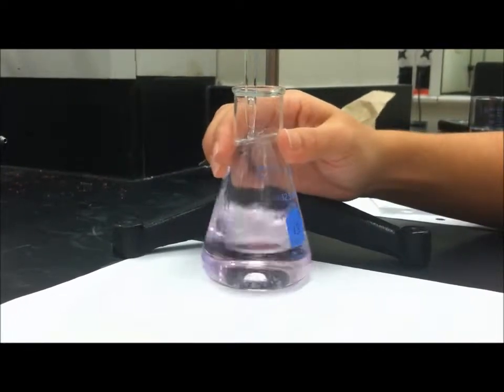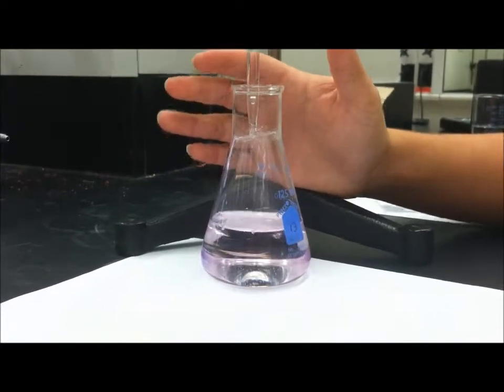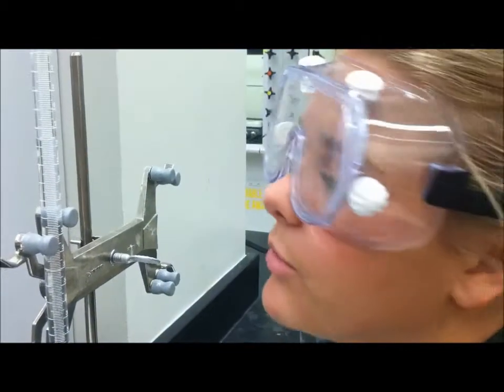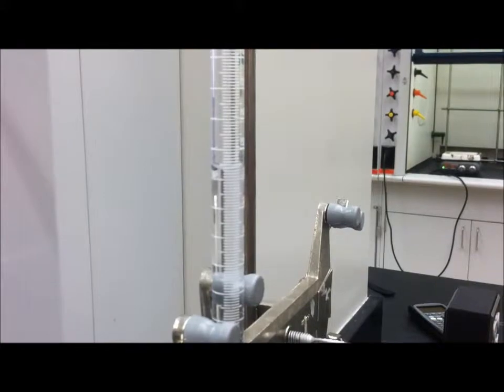And it looks like I've reached my endpoint. So now I'm going to take my final volume. Our final volume is 25.7 milliliters.